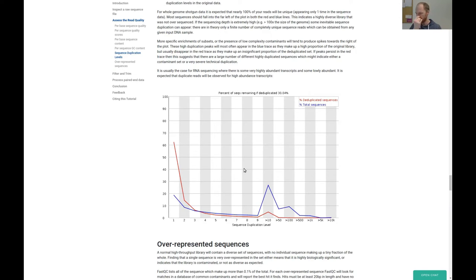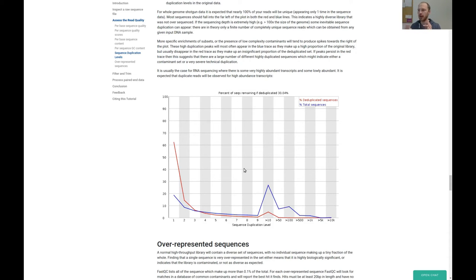Ask whether you should do deduplication or not. I would only deduplicate if I have enough material. For differential expression analysis you need at least 10 million reads, and if you don't have enough and you deduplicate, you will heavily influence your downstream analysis. So only deduplicate if you have enough reads.